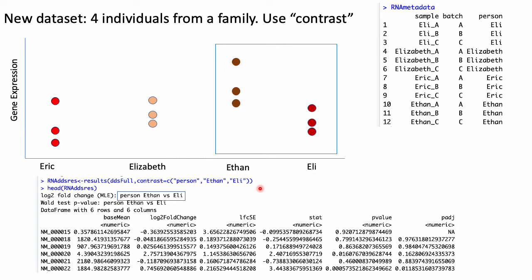This is convenient as DESeq2 is able to calculate these comparisons on the fly, even if both have a difference coefficient, which saves you from having to rerun the comparison over and over again using the sample of interest as a baseline. In other words, getting the other results is easier if we just use a contrast rather than running the entire experiment again.